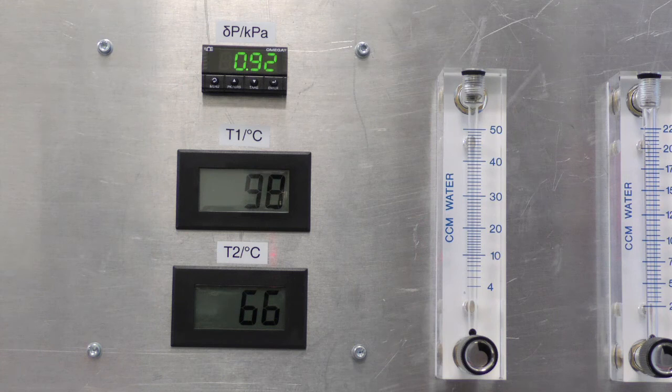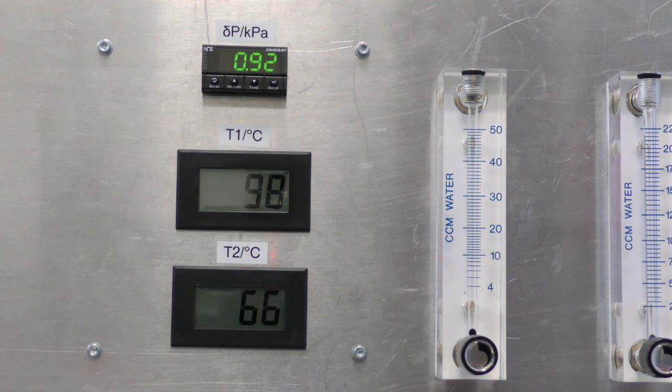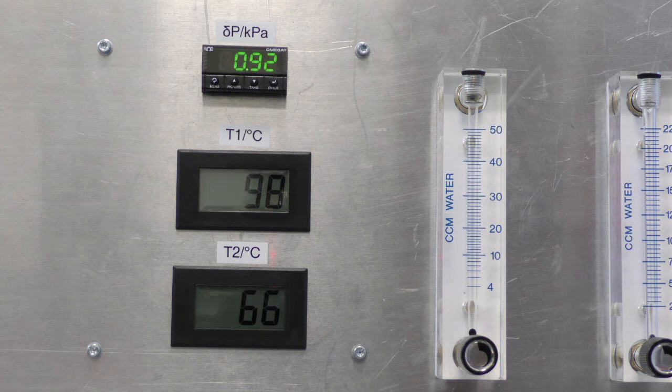Now the system has been operating for some time and is at a steady state. We can read the reboiler temperature, labeled T1 on the panel here, and also the temperature of the vapor leaving the top of the column, labeled T2.